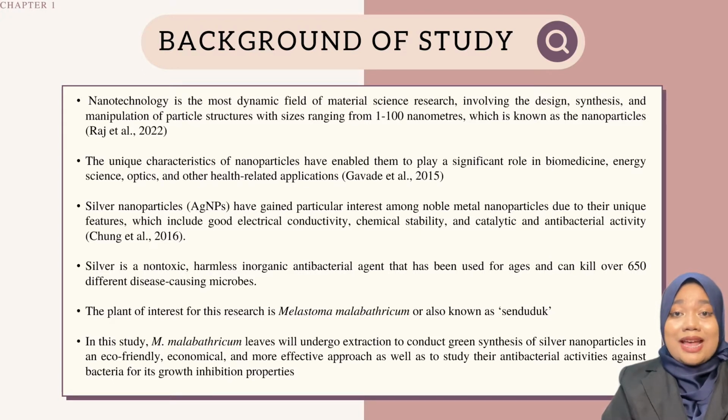related applications. Silver nanoparticles have gained particular interest among noble metals nanoparticles due to their unique features, which include good electrical conductivity, chemical stability, and catalytic and antibacterial activity. The plant of interest for this research is Melastoma malabatricum, or also known as Senduduk. In this study, malabatricum leaf will undergo extraction to conduct green synthesis of silver nanoparticles in an eco-friendly, economical, and more effective approach, as well as to study their antibacterial activity against bacteria for growth inhibition properties.